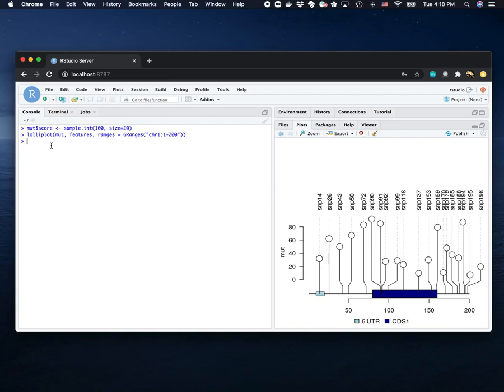And then we want to change the color of the plots. We change the color by directly assigning a color to the mutation data. We say the color, for example, max number is 8, and then the size is 20.